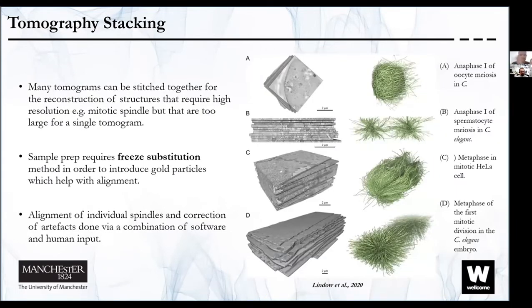My last technique, I really like this technique because it's not so much technologically driven, it's just hard graft. So this is the concept of tomography stacking. So if anyone remembers, problems with tomography are that it is super thin. It's very thin sections, 100 nanometers, 200 nanometers, something like that. But it has really high resolution. Often you need to make models of things that require high resolution, but you don't want to be limited by the thinness of tomographs.